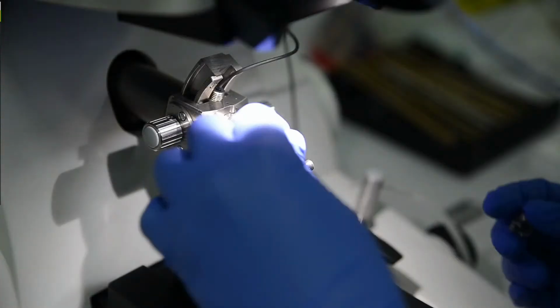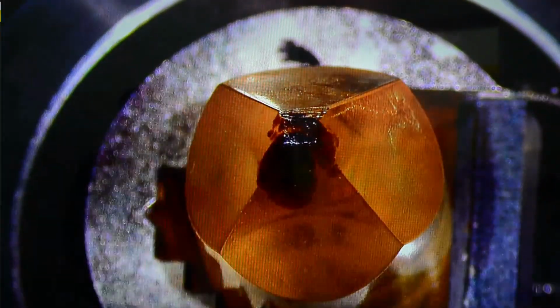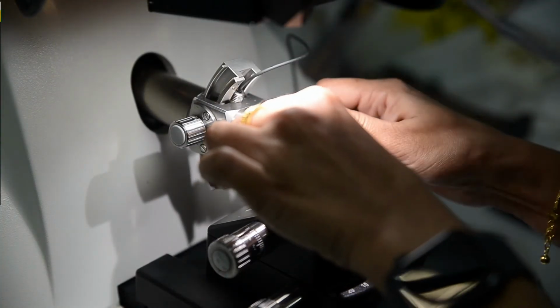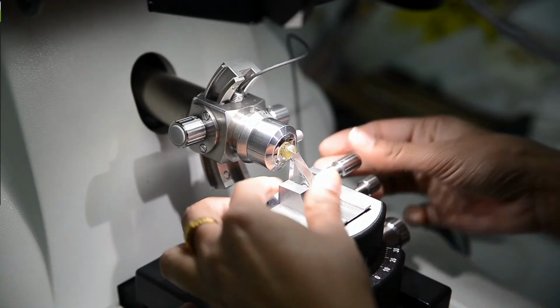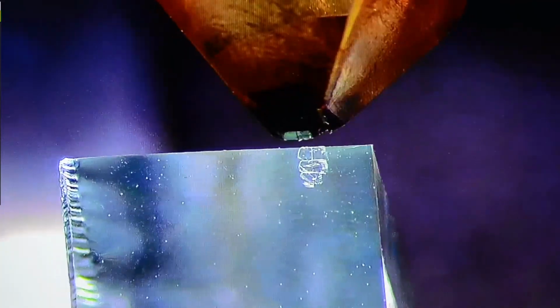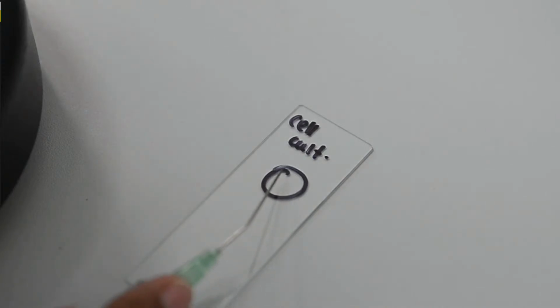Then now we proceed to sectioning. The first process in the sectioning is we trim the sample into a trapezoid shape. And then we place the sample on a sample holder, and then we proceed to the glass knife. Using the hand wheel, we slowly cut the specimen using the glass knife. Once we get a good section, we take the section out from the glass knife and transfer it to the microscope slide.